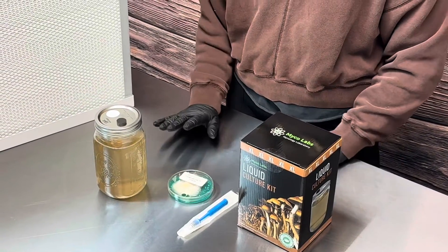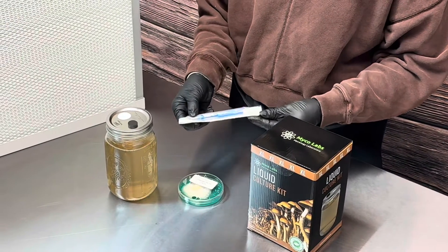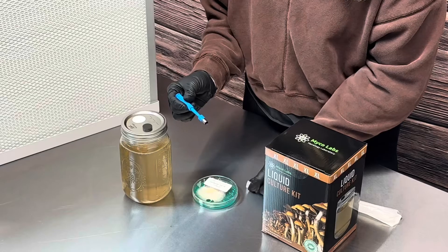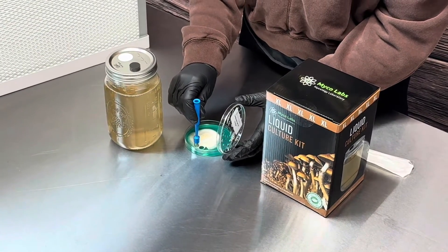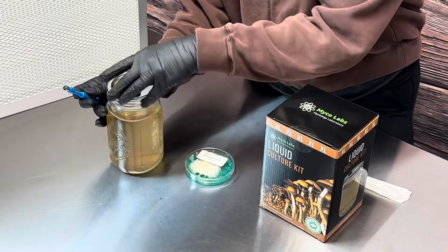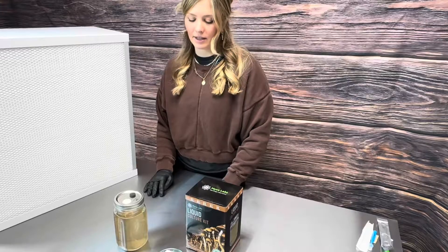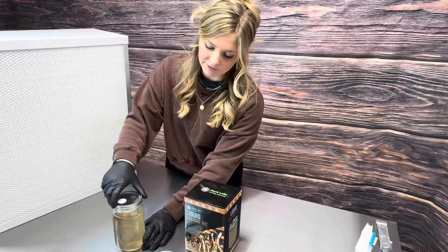Now we're going to show how to take a culture from a cordyceps agar plate using an agar punch tool. Take it out of the packaging, remove the lid, open up your plate lid, take a punch, close the plate, open the liquid culture jar, tap it in, and place your lid back on.